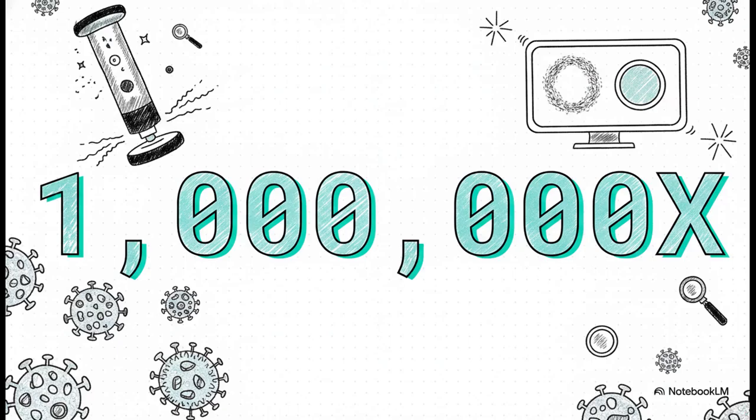And because their resolution is so astoundingly crisp due to those tiny wavelengths, the magnification ceiling just absolutely explodes. While optical systems tap out at a useful magnification of about 2000x, electron microscopes can easily push past a massive 1,000,000x magnification. We're talking pulling the deepest secrets of viral capsids and proteins right into plain view.